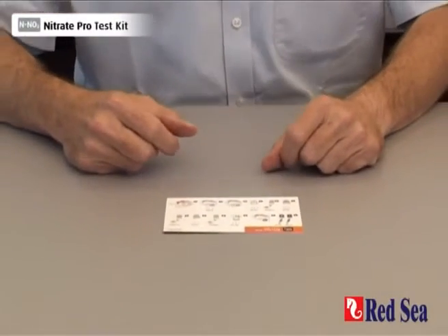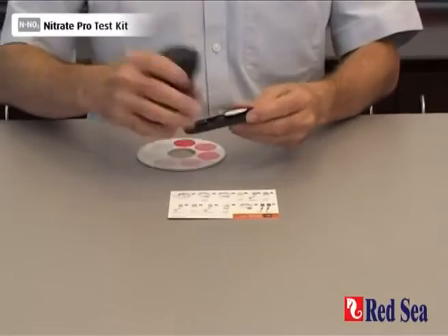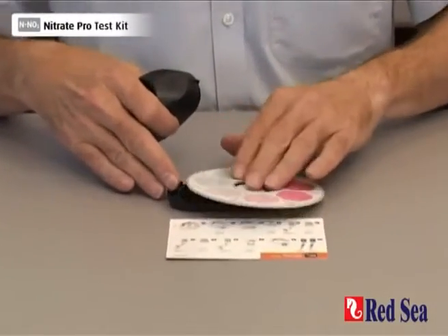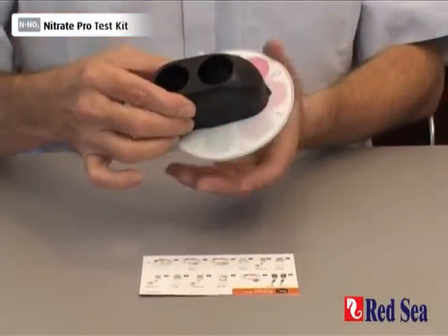Before we can do the nitrate test, we have to assemble the comparator with the nitrate color disc in it. Open up the comparator, place the disc in the center and hinging at the back, pop that into position and make sure that it rotates easily.